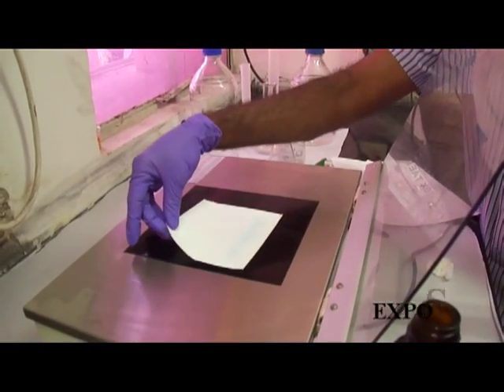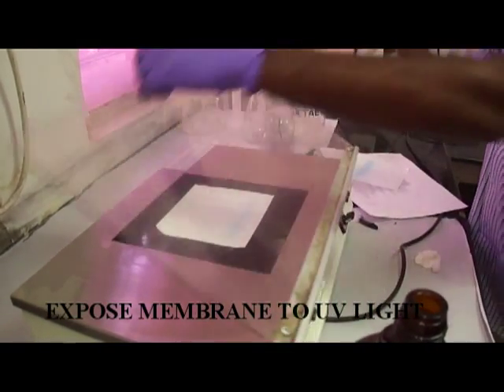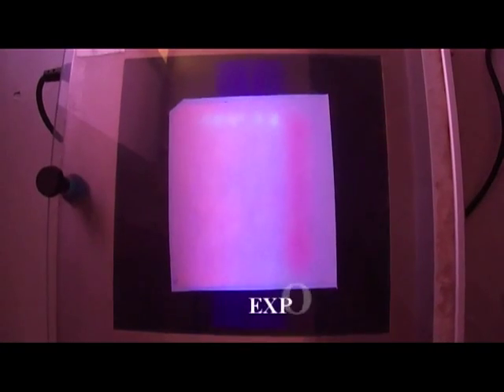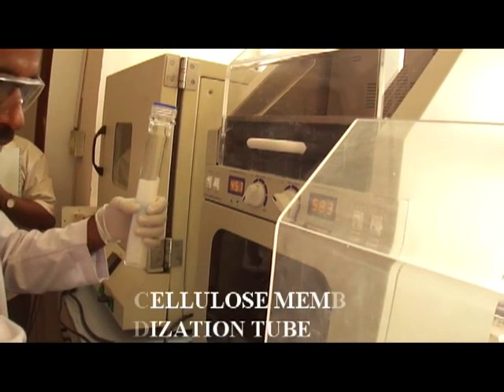Then for cross-linking, fix the DNA to the membrane by using a UV transilluminator. Care should be taken that the DNA face is downwards to the transilluminator. Allow this exposure for five minutes under UV light.